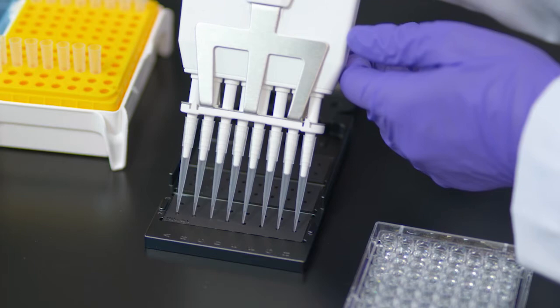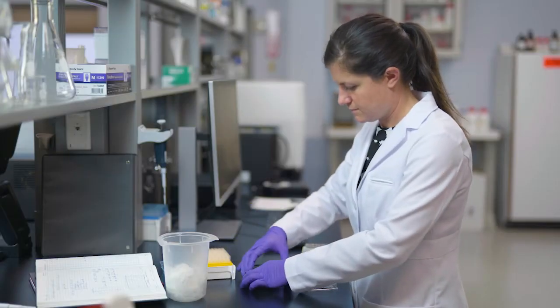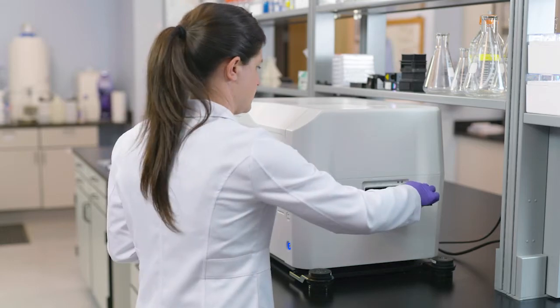The BioTek Take-3 plate extends Citation's detection capabilities to microvolume protein and nucleic acid quantification.